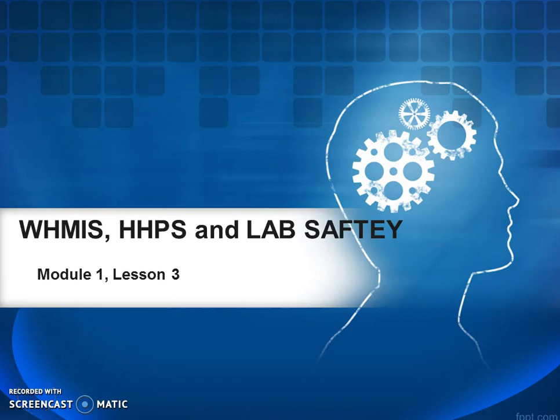Hello and welcome to Module 1, Lesson 3. As you can see by the heading, we're going to take a look at WHMIS, HHPS, and lab safety.